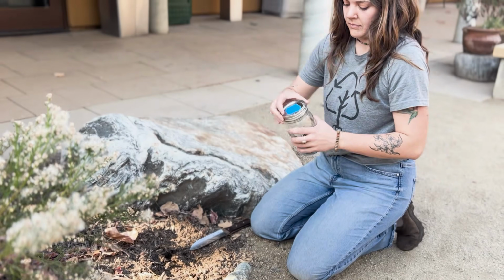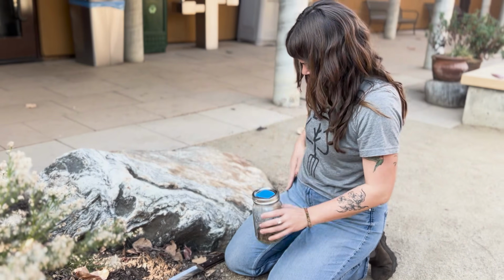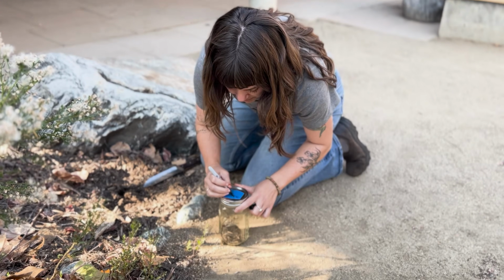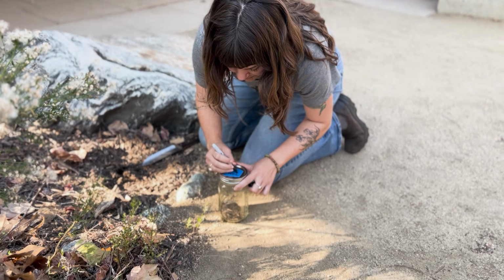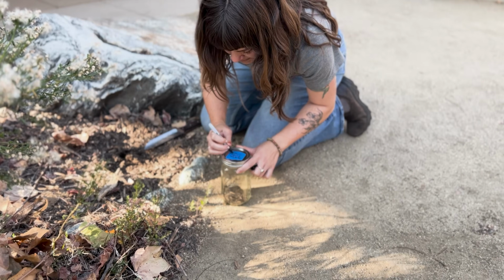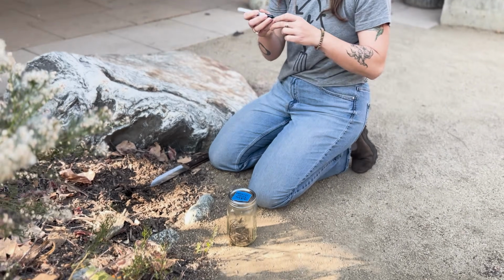Keep your soil in an airtight container like a mason jar, Tupperware, or Ziploc bag. Don't forget to label your sample with a date and description. It can also be helpful to take additional notes about the environment that you got the sample from. You can hold samples for up to 2 weeks after collection.